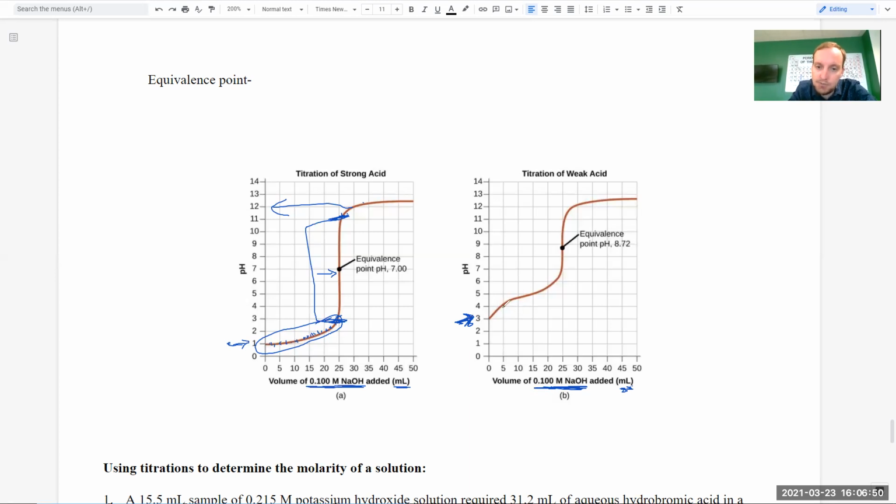So drip by drip. Again, we're going to get a little bit of change, not a lot. We're just being very patient, going drip by drip, and we're going to look for a color change. I'm going to start seeing a color change, and then very quickly it'll go from here all the way to there if we're not careful. And after that, it's pretty much done, and you're not going to get any result.